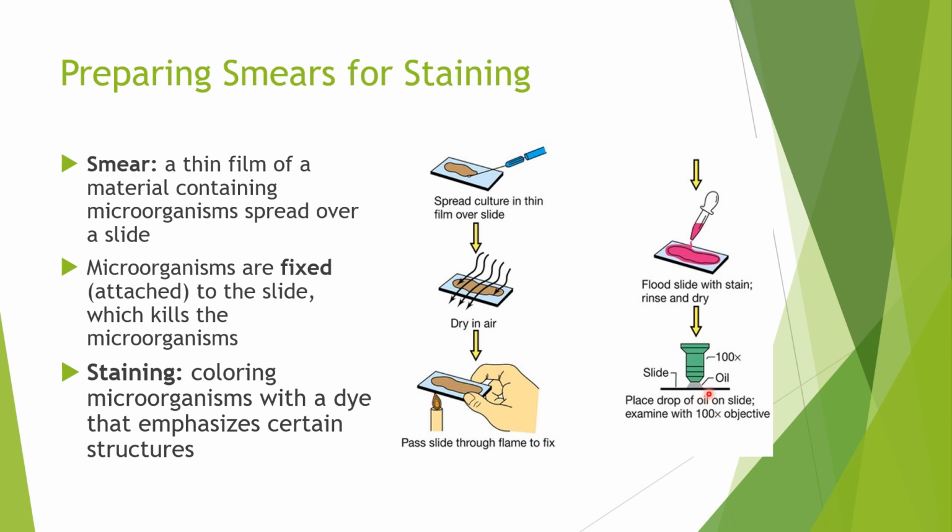And then usually after we heat fix, we stain it. And as I said, sometimes you go from air drying directly to staining. We'll talk about those procedures where you should skip this part right here.